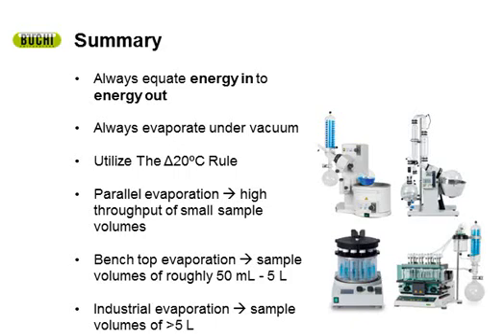Is there any difference in evaporation throughput from a dry ice versus a water-cooled condenser? Not so much throughput. What can happen if you're using dry ice, since the temperature is minus 85 degrees Celsius, you can be a little more aggressive because your goal as a user is to keep that vapor level three-quarters of the way up the condenser. If you get it too far up the condenser, that's when you flood the condenser and pull solvent into the vacuum pump. So you're less inclined to pull solvent into the vacuum pump because you're using such a low temperature. So you can be a little more aggressive with the vacuum.